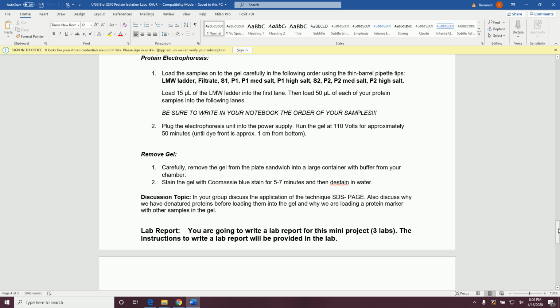This week I want you to read this lab, watch this video, and read the discussion points. Make sure you understand all the discussion points. Also, we run a protein marker with the other samples. What is the protein marker? We buy the marker from companies, and it is a kind of reference in the gel. We know that when we run it on the gel, we see 7 bands and the exact size of each band, so that we can compare the size of the other unknown bands in the gel. So the protein marker is a reference.